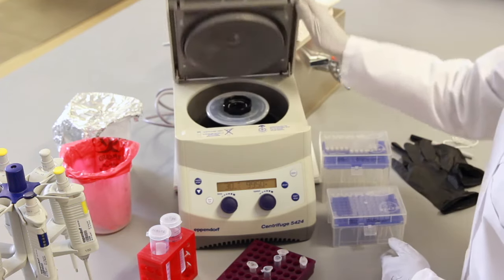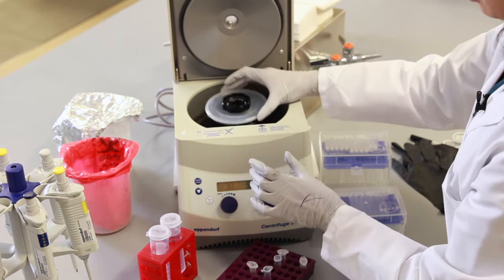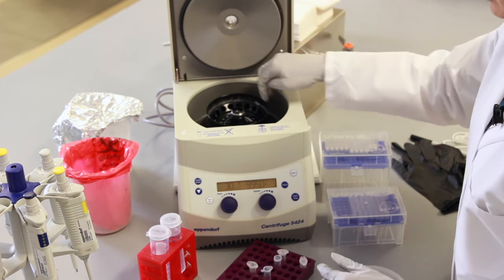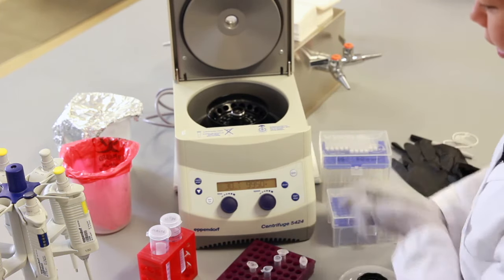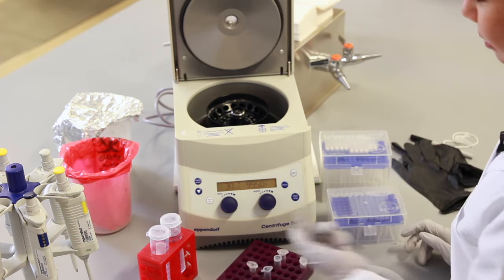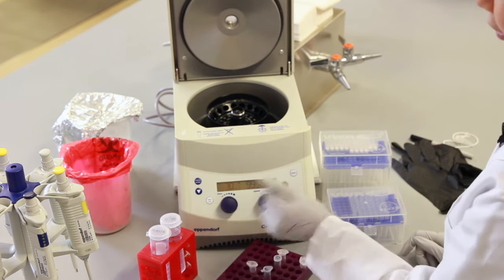When I approach a centrifuge, I can open it using this open button over here, which exposes the main body where the centrifugation happens. Usually there's a little screw top lid that sits on top of this, which when you pull open, you'll find the areas where all your samples are actually located. The other part of the centrifuge to pay attention to is the menu body here, where all your different settings are controlled for your centrifuge. The first one is time. You can see I have it set to 30 seconds right now. I can also increase or decrease the time as I see fit. I'm going to leave it on 30 seconds.